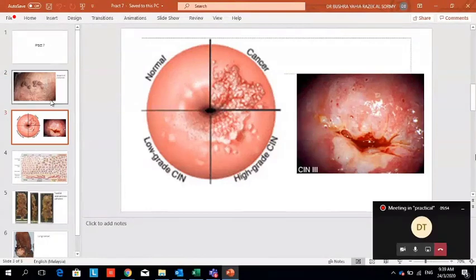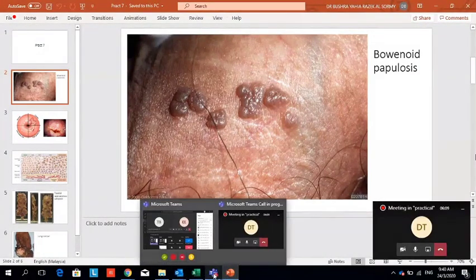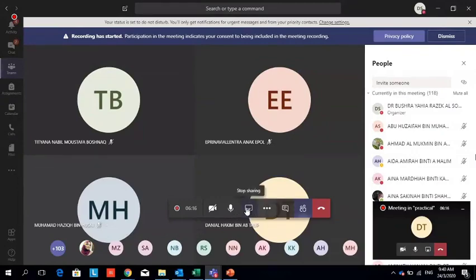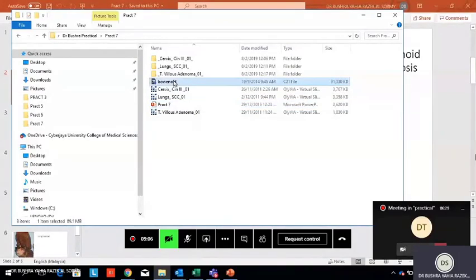This is what we expected, the gross picture. Okay, so our slide. This one.